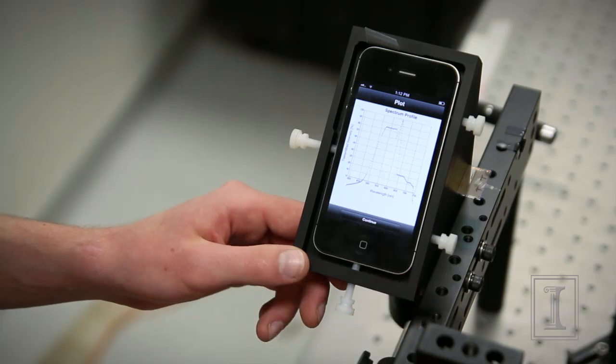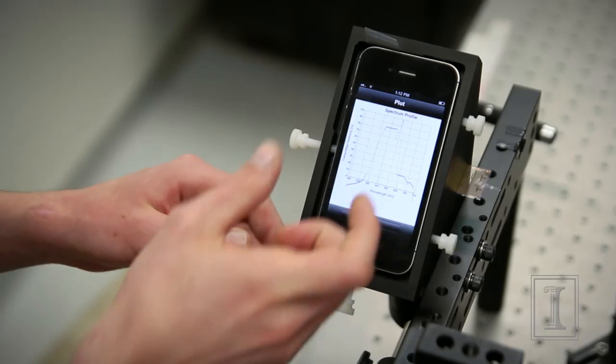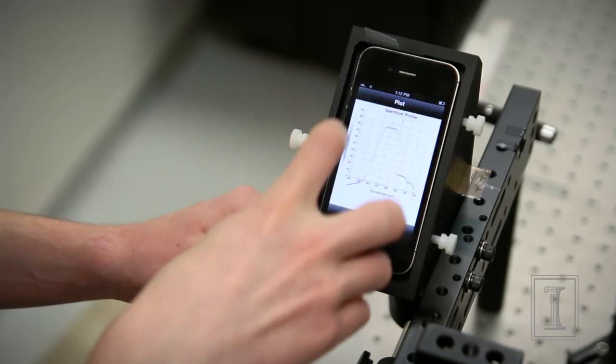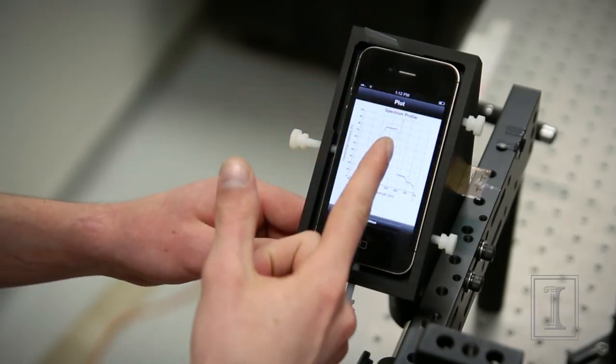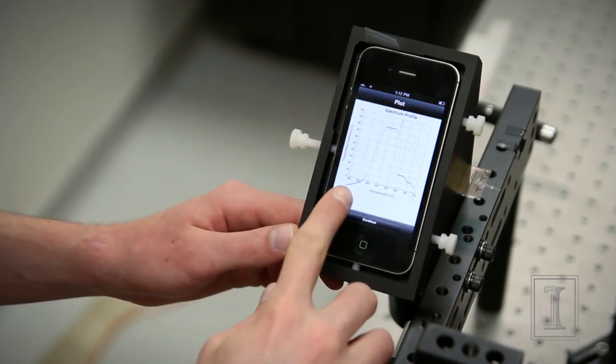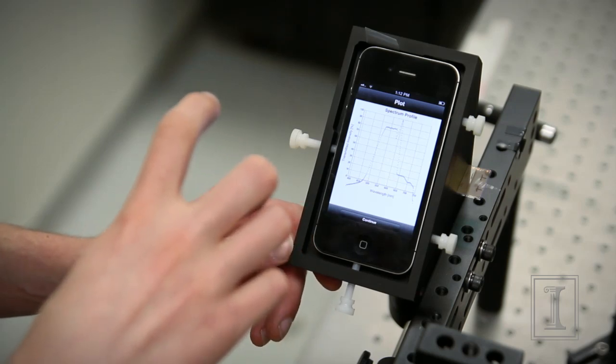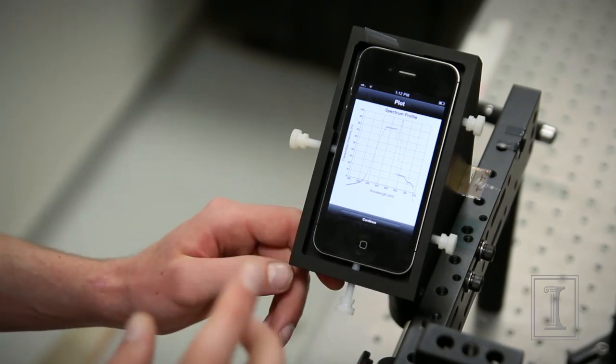All right and so there we have a spectrum right there, but what we're looking for is actually this dip right here in the spectrum that corresponds to the black gap in the spectrum that you saw on the previous screen. And as that low point moves left and right across the wavelength spectrum, that basically tells us what the shift is in the center.